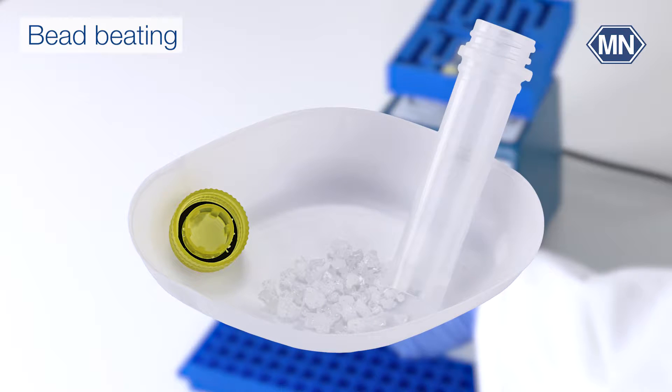The first method in our toolkit is bead beating. Here we turn to mechanical force — we use small beads and a high-speed homogenizer or a bead beater to vigorously shake and disrupt your samples. Bead beating is particularly handy for tough or resilient samples and it can be easily scaled up for larger quantities.